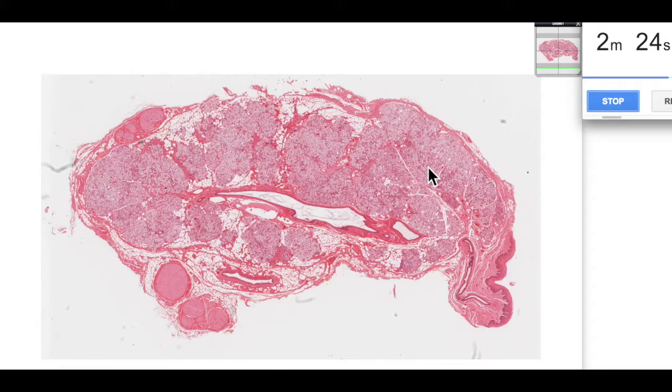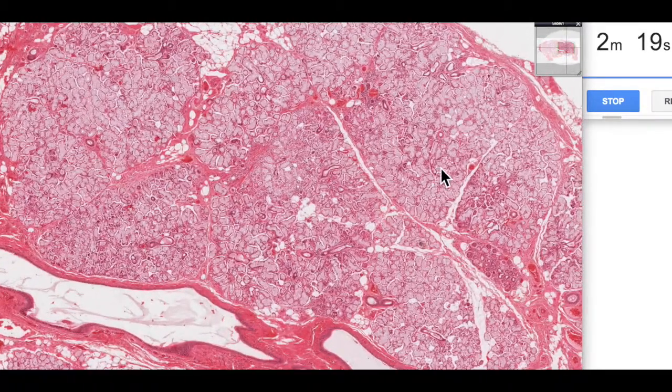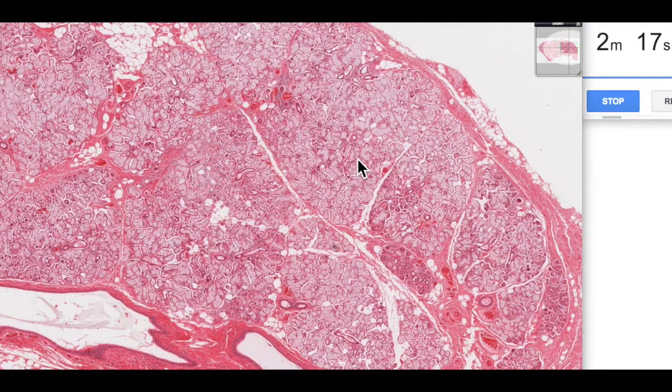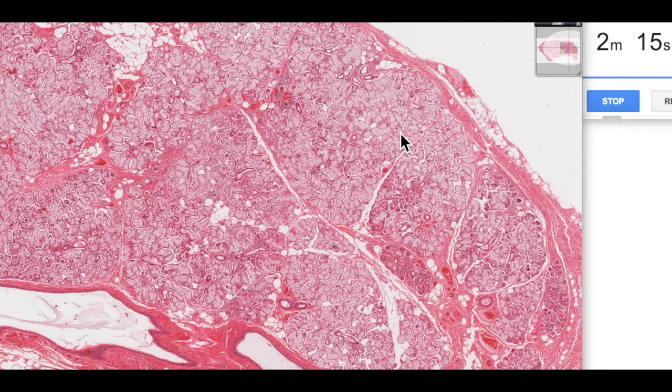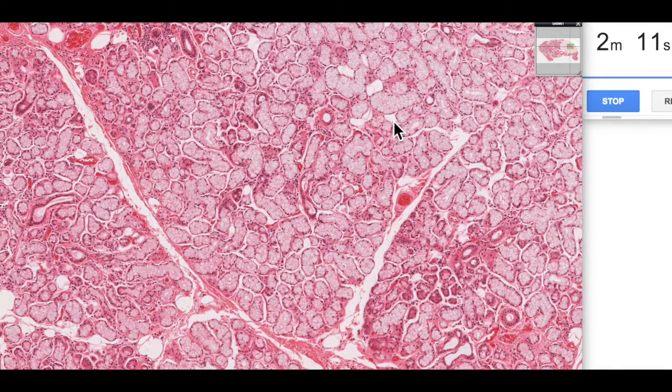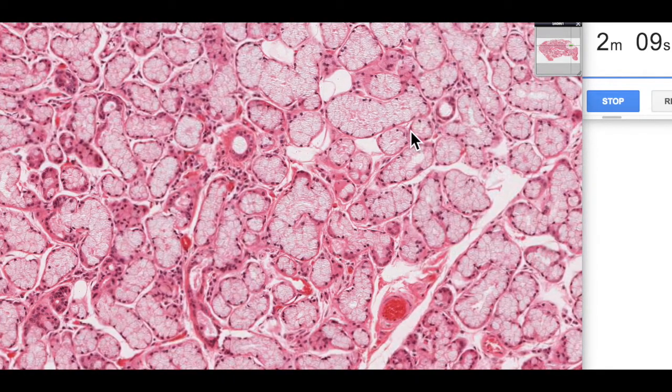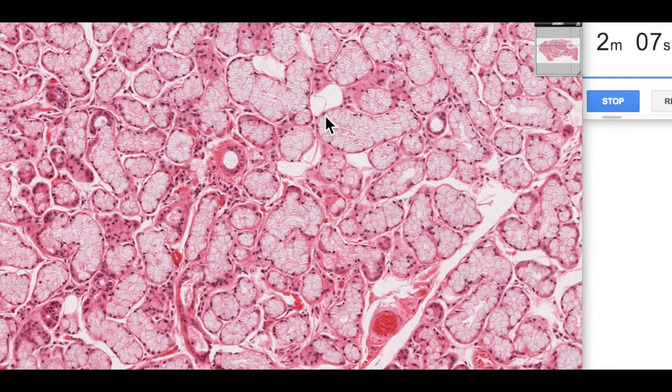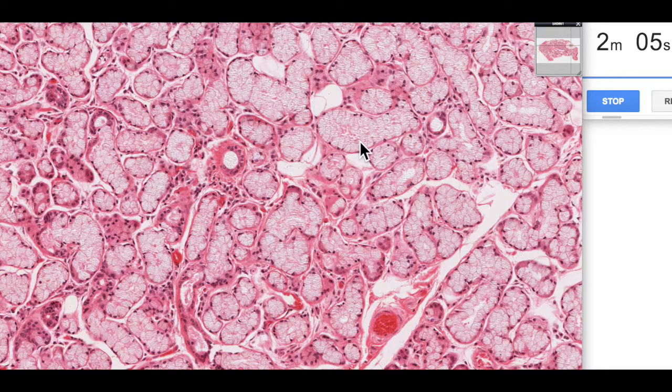Now the sublingual salivary gland is predominantly mucus secreting. So if we have a look at a little bit higher magnification, we can see all of these mucus acini, very pale staining.